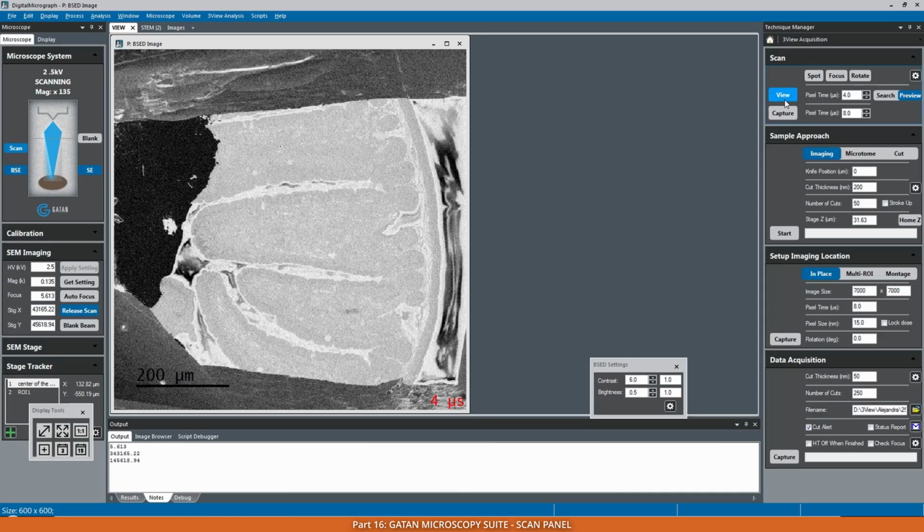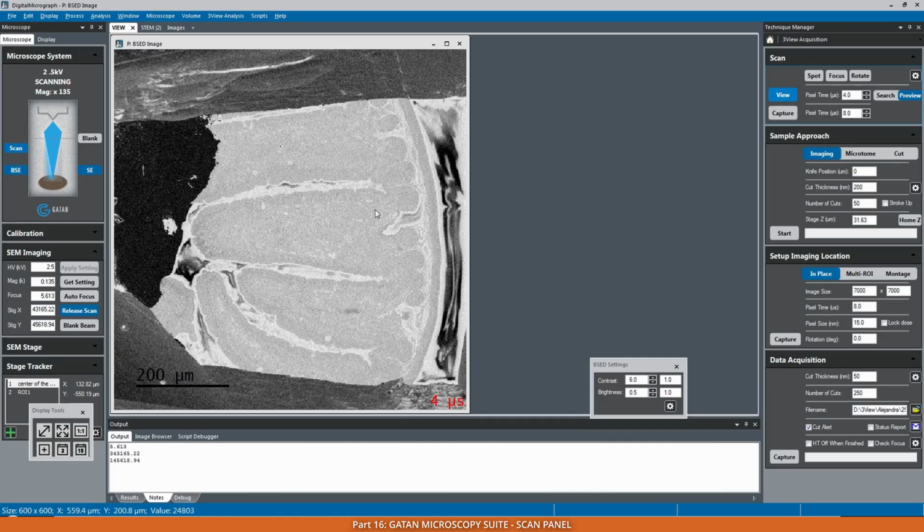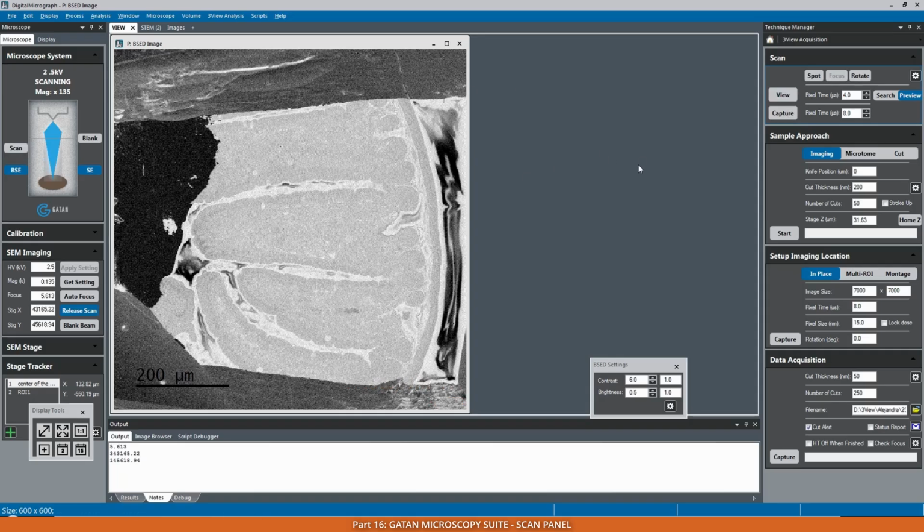So here, just make sure that you waited until the operation which you're doing now is over. For example, do not press any other buttons unless you, for example, stop the view. So I stopped the view, made sure that it's actually finished and the button changed its color, and I can go and press capture, or maybe go somewhere, do something else. Otherwise, it may actually crash. That happens sometimes if you do things too quickly.